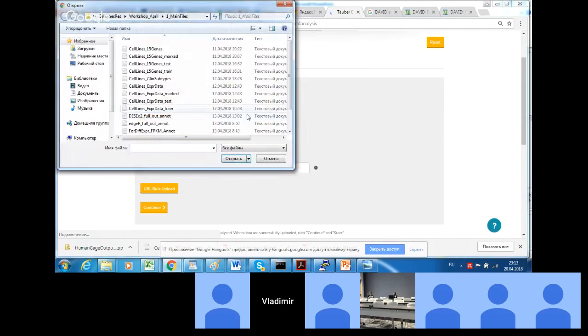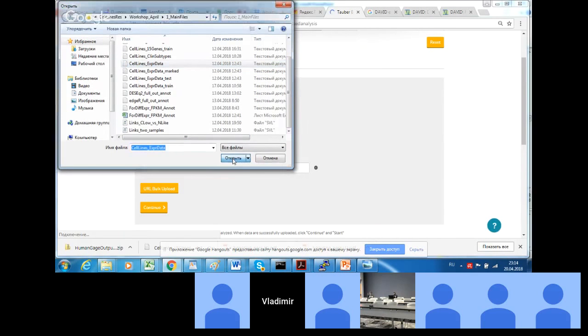Upload the file we're talking about. The file cell lines expression data.txt.